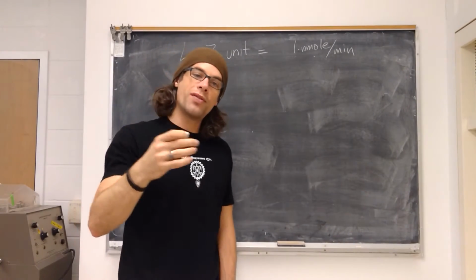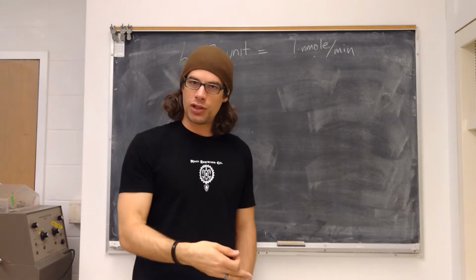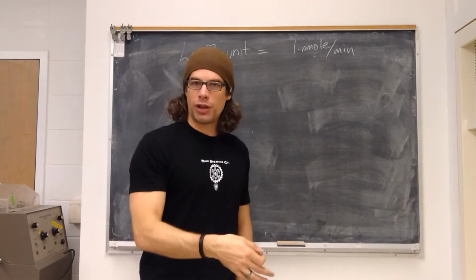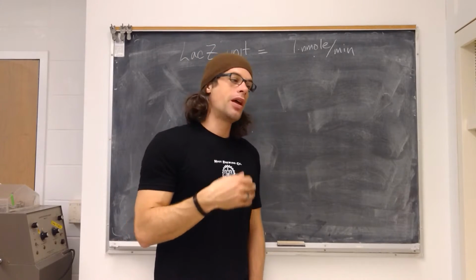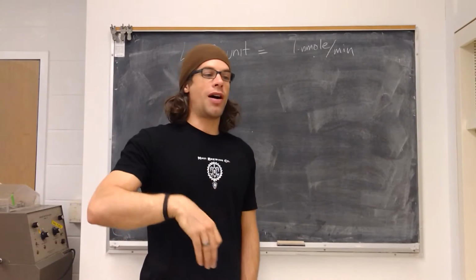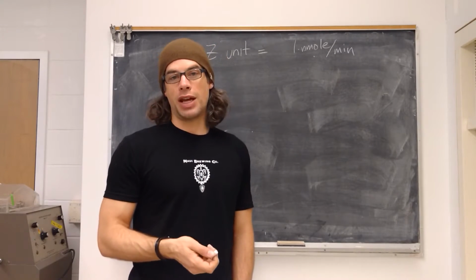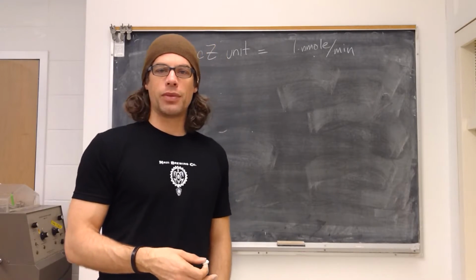Now, you know what volume of whatever reagent you put into that assay. Was it 50 microliters of bacteria? Was it 2 microliters of cleared lysate? Was it 10 microliters of purified protein? From that, you can ultimately work out the units per microliter of whatever substance you put into the assay. Okay? So it's just units over whatever volume you add into the assay.